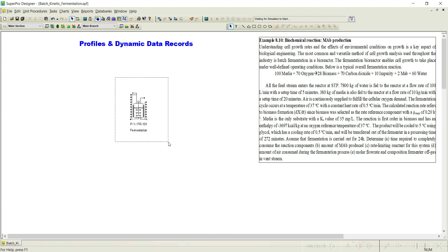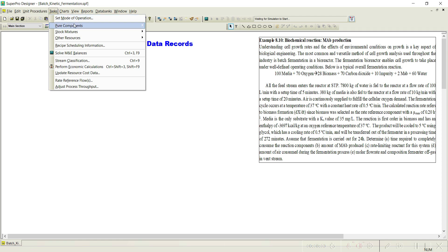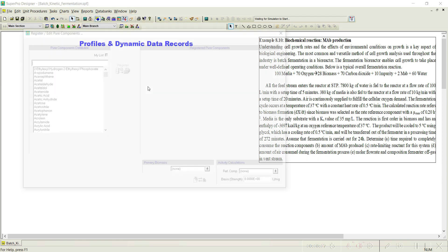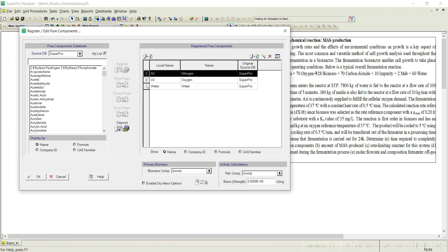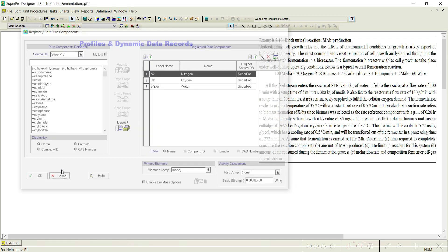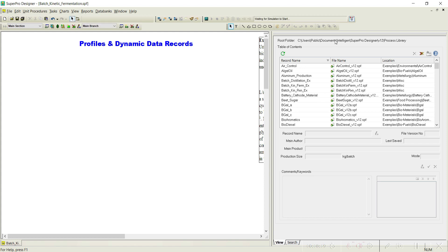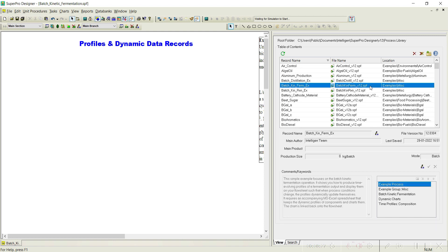Let us explore it in the later stages. First, let us simulate this. I will register the pure components required for the simulation of this particular problem. This file is also available in the process library of SuperPro Designer. Go to View and Process Library — under the miscellaneous folder you can open the batch kinetic fermentation example. This simple example focuses on batch kinetic fermentation operation and shows how to produce time-evolving profiles of fermentation output and display them on your process flow sheet, such that when process conditions change, the profiles dynamically update themselves.